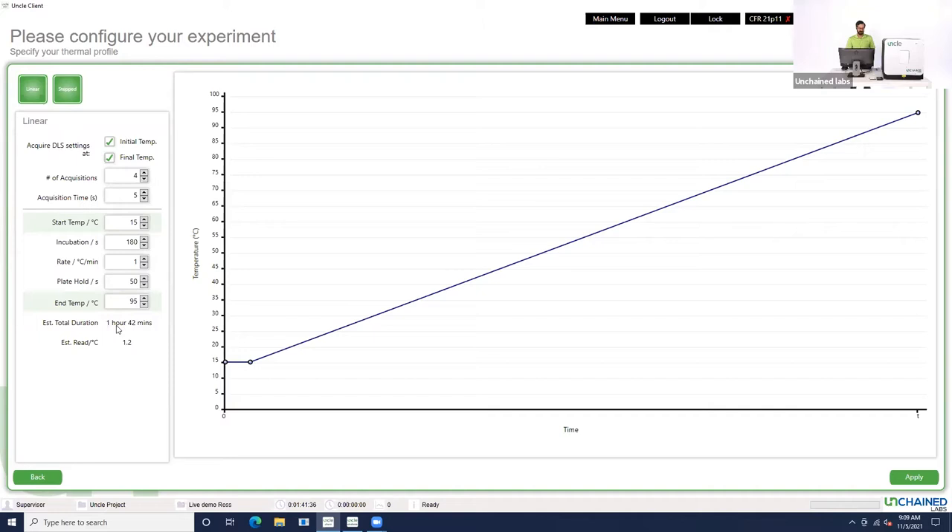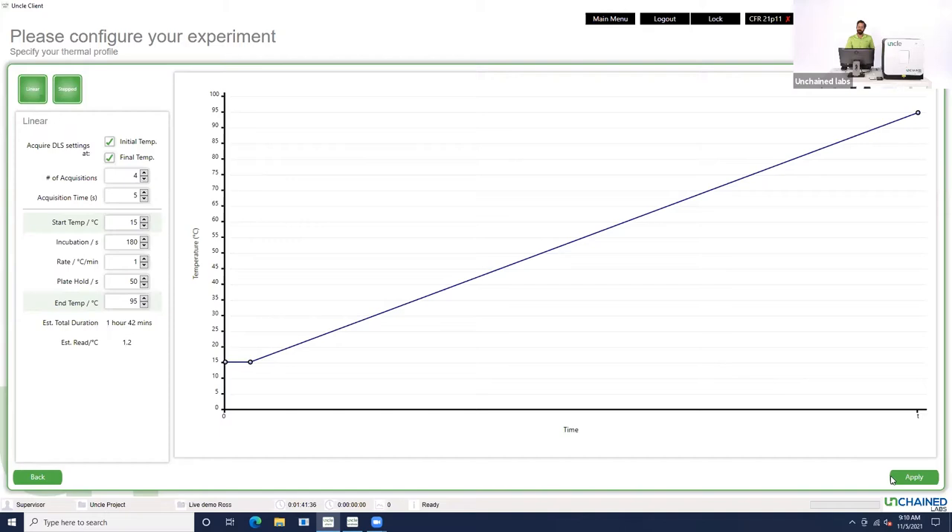The total duration of this experiment is going to be about 1 hour and 42 minutes, because of the DLS reads and the ramp rate we're using. That's a pretty long experiment for a live demo, but a pretty short experiment when you have to screen a bunch of samples. So I think we're just going to start the experiment and then I'll show you some data from these samples that I ran a little bit earlier.